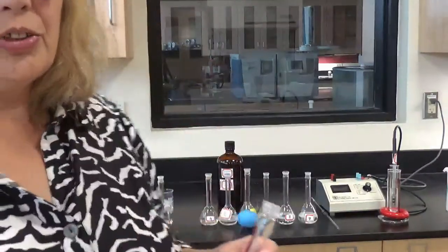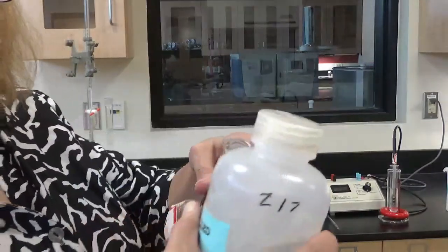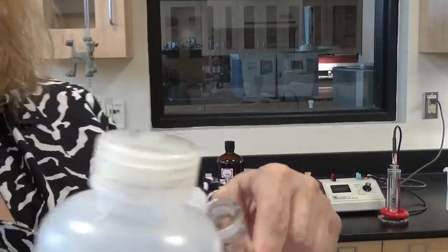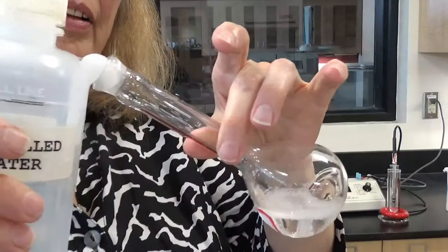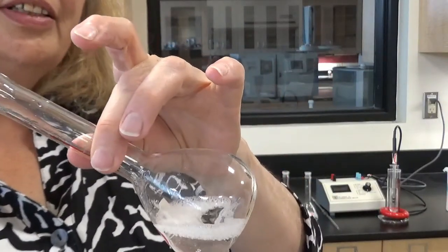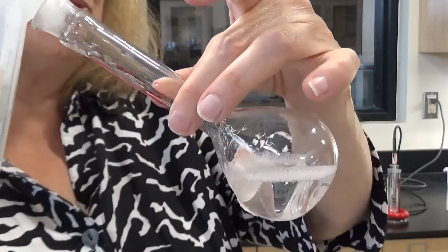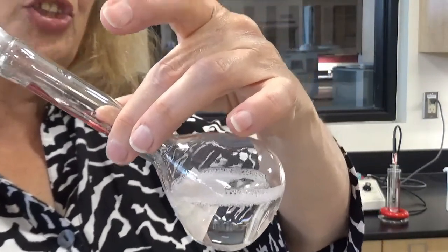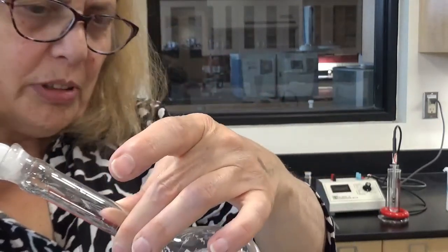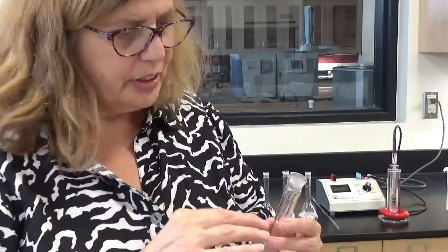So I just want to show you how when you fill this, it helps if you go down the sides of the flask. So I fill it like this, and it stops it from foaming up too much. If I had too much foam, it would be harder to see where I should stop.